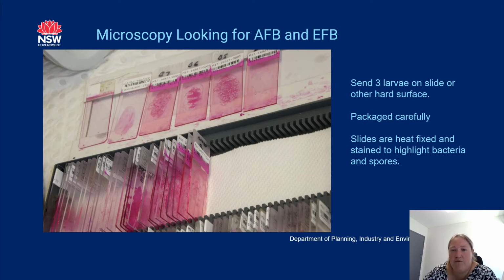If you've got that ropiness, or you've taken some sample from a brood comb, you can send it in on any hard surface and we will sort out making a slide from that, preferably slides, but if they're too hard to get a hold of, you can always send it in on anything. We've had mirrors, we've had coffee cup lids, we've had all sorts of submissions sent in to us, and we will always try and come up with an answer as best we can.